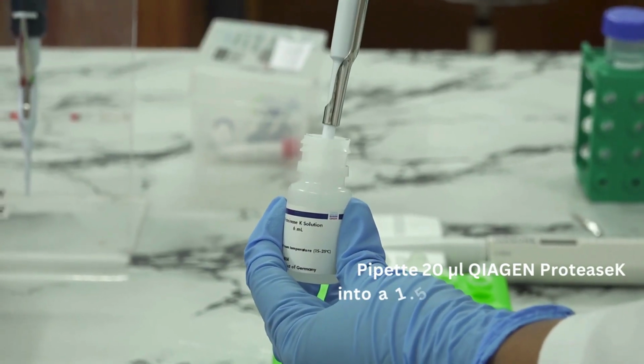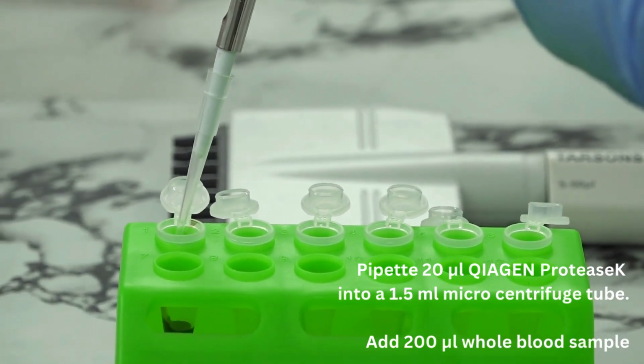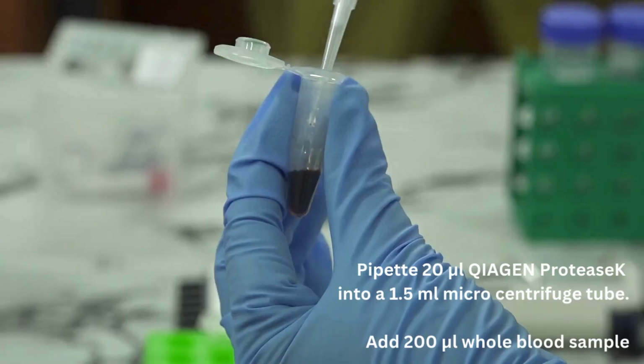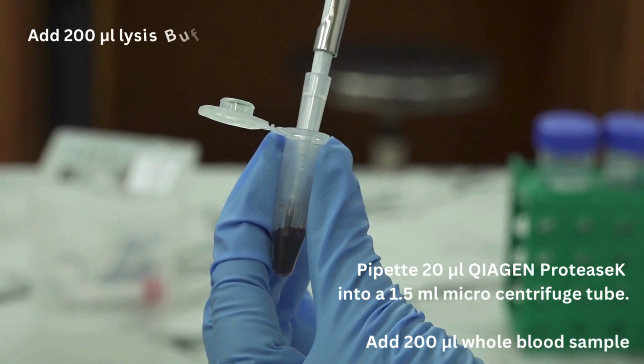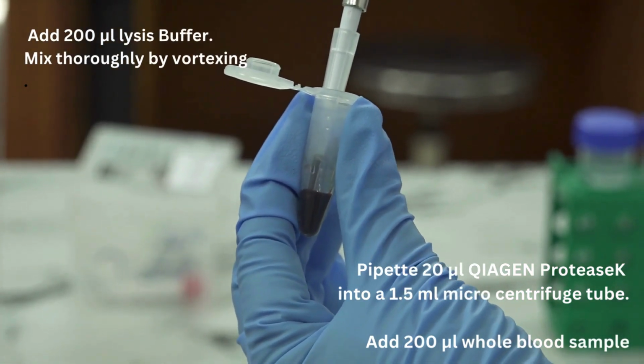Pipette 20 microliters Qiagen protease K into a 1.5 milliliter microcentrifuge tube. Add 200 microliters whole blood sample. Add 200 microliters lysis buffer. Mix thoroughly by vortexing.